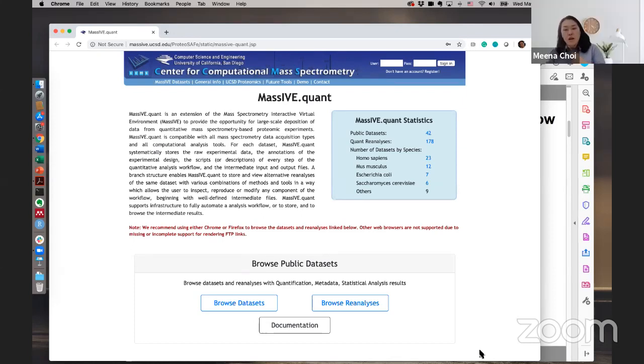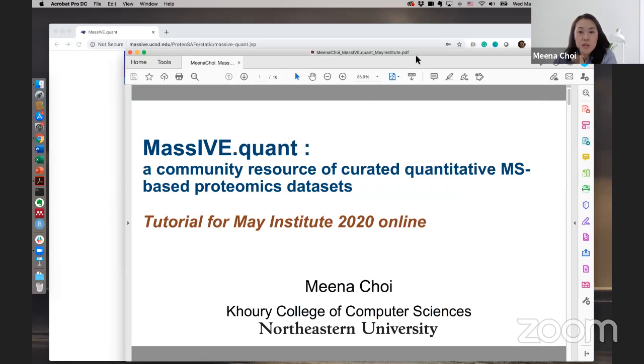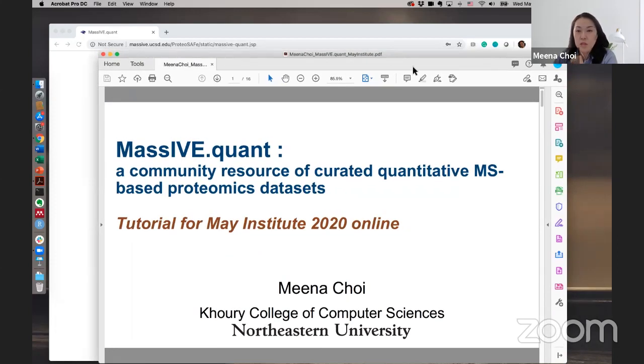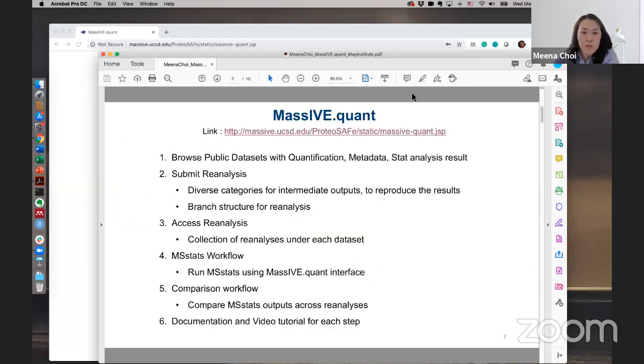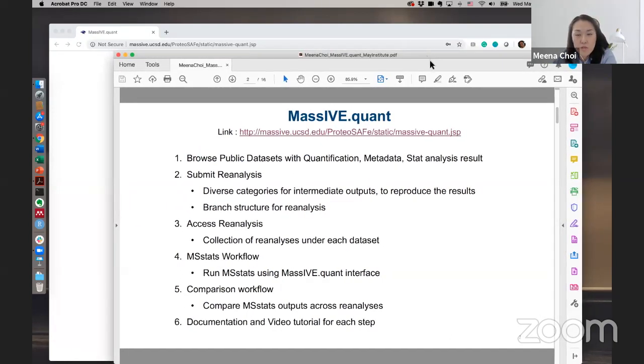Thank you. Good morning, good evening, good afternoon, everyone. So I'm back. Today I will just demo how to use the MassIVEquant. We have a slide, and there's a link for this slide in our Google Doc. So let's start. Nuno already went through all the details of the new features, but I will just go over them one by one.